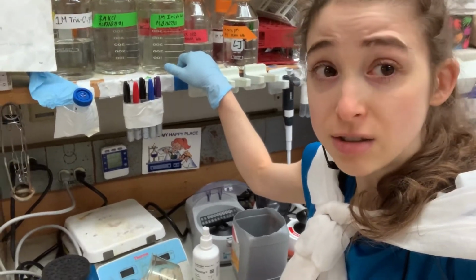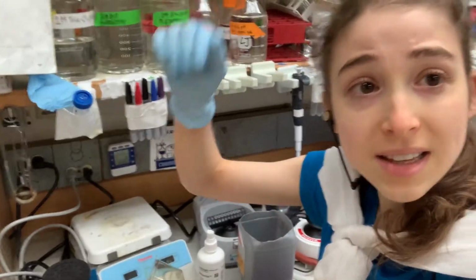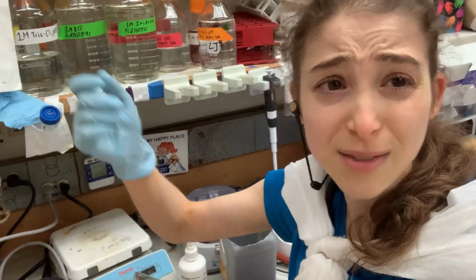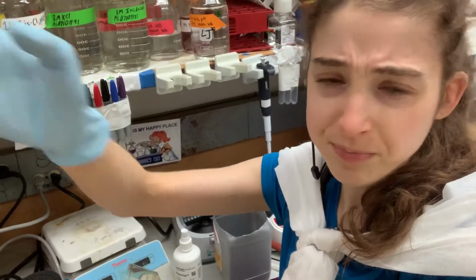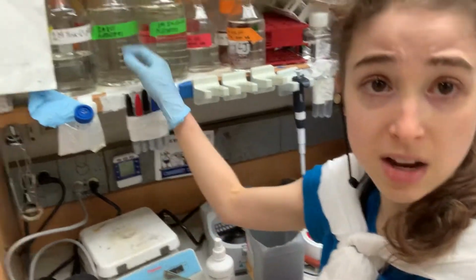Similarly, when we're making solutions in the lab, we don't want to have to make everything from powder every time, because that involves weighing things out, measuring, mixing, waiting for it to dissolve. If you want to do different pHs, then you have to pH test it, and with all of these different steps you're adding error because you're weighing out small amounts of things. So basically we don't want to do that. So instead we make stock solutions.